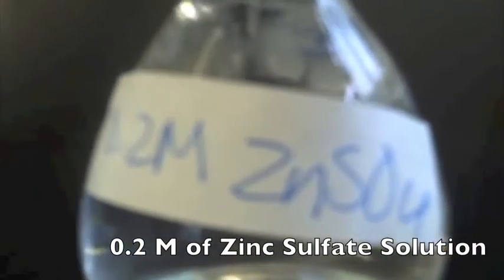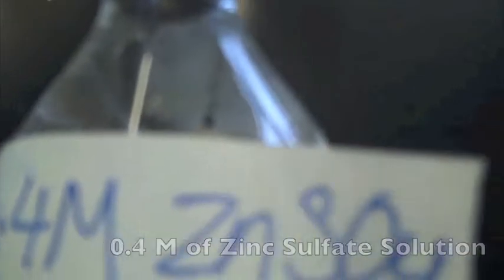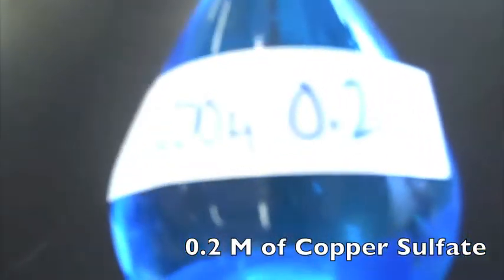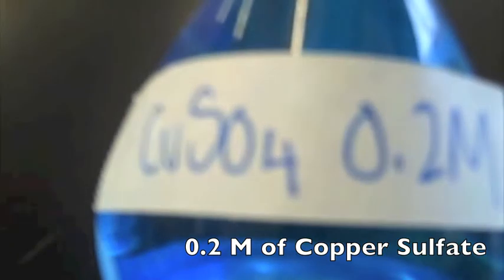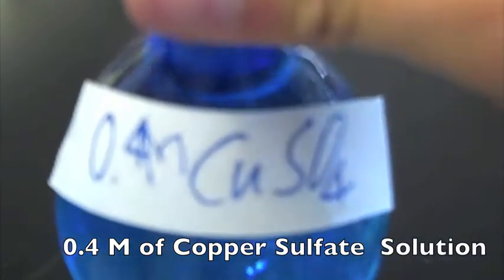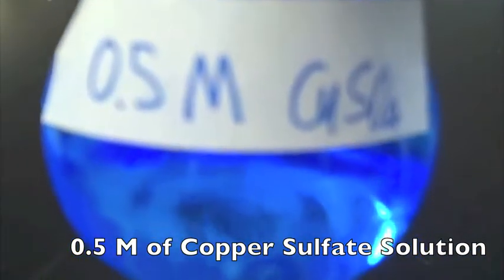So firstly, we had to make the solutions. Here is the 0.2 molarity zinc sulfate solution. Here is the 0.4 molarity zinc sulfate solution. And here's the 0.5 molarity zinc sulfate solution. This is the 0.2 molarity copper sulfate solution. This is the 0.4 molarity copper sulfate solution. And this is the 0.5 molarity copper sulfate solution.